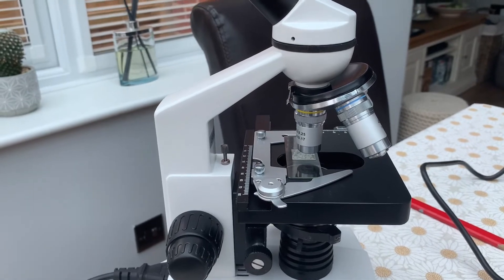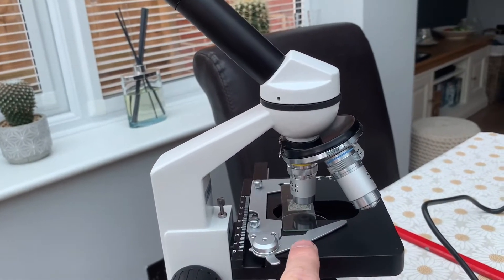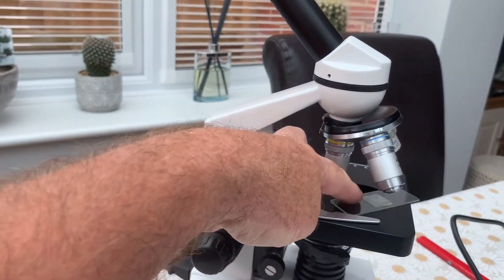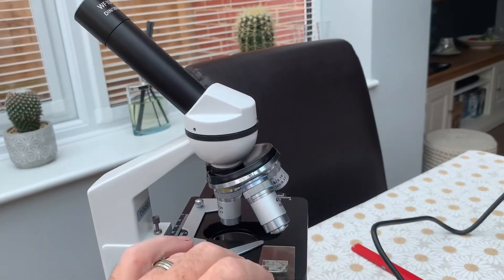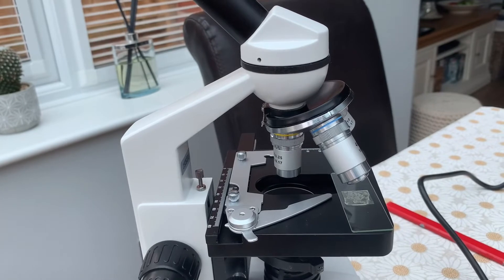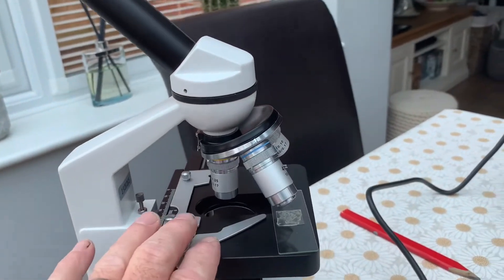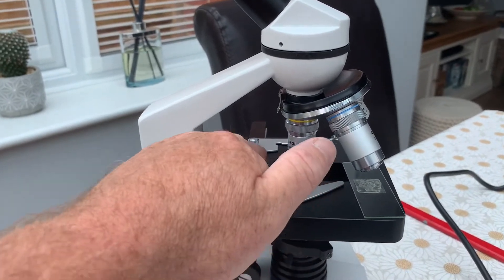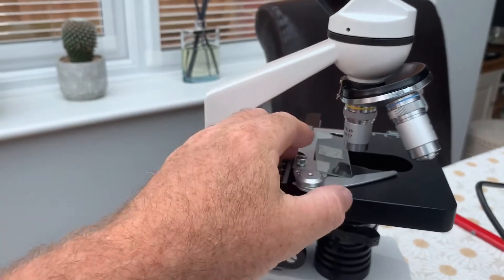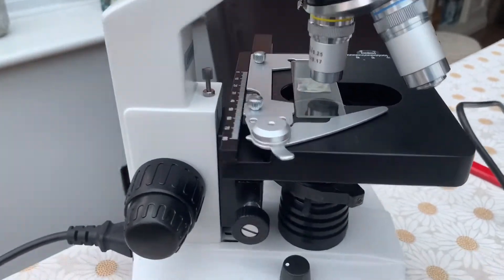Moving down from the objectives, you've got the stage — that's where you place your slide. On the cheaper microscopes all you get is a plain stage. But this piece here is what they call a mechanical stage. You pull the lever back and drop the slide in. The mechanical stage makes life a lot easier rather than using your fingers to push the slide backwards, forwards, up and down.